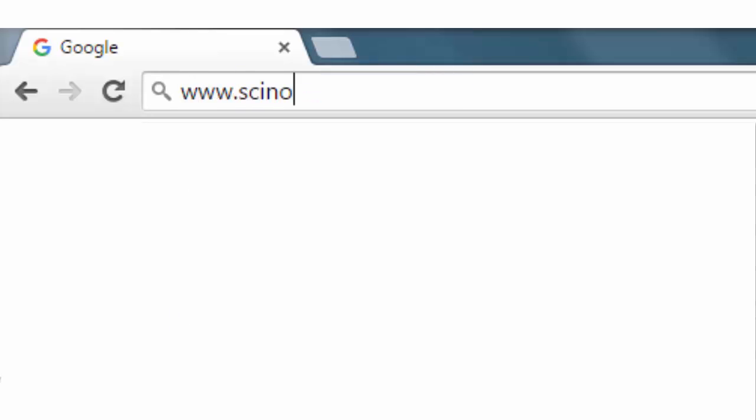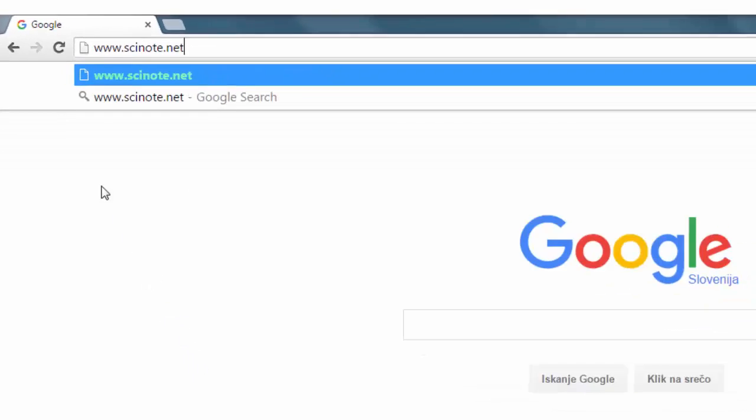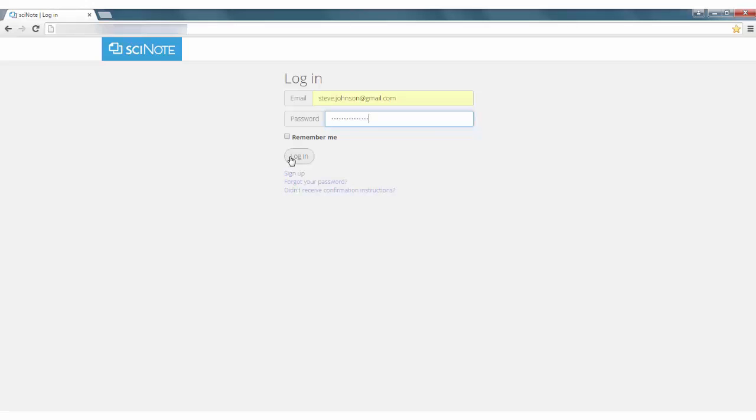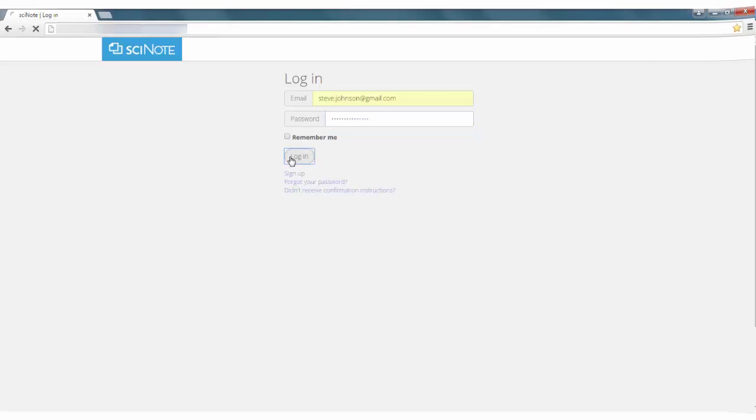To start, go to www.scinote.net and log into your account.